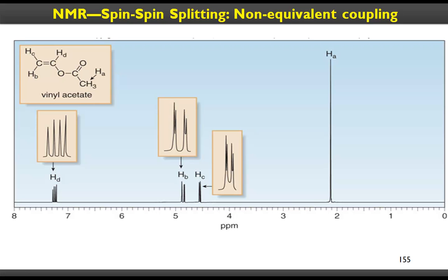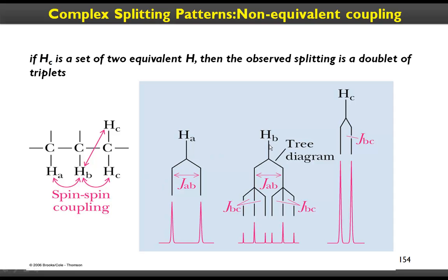So let's go back for a minute. You have to first divide the peak or take the one which has a higher coupling constant and then draw this tree diagram. You don't want to do it the other way around. Probably that also would give the same thing, but it would be easier for you to derive the tree diagram if you follow this rule. First take the nuclei that is influencing with a much higher coupling constant and do the splitting, and then do the other splitting, that is the smaller coupling constant. So that would give you the tree diagram. Any questions? If not, let's go forward.